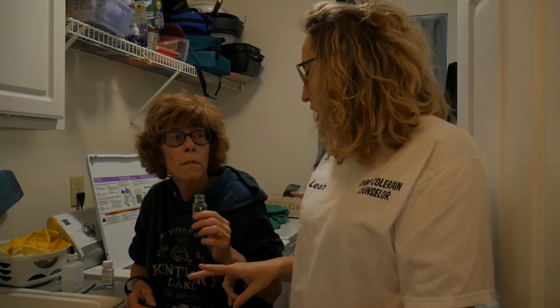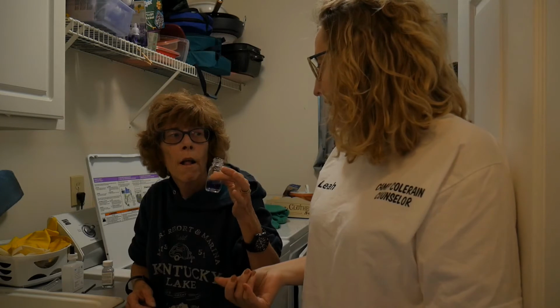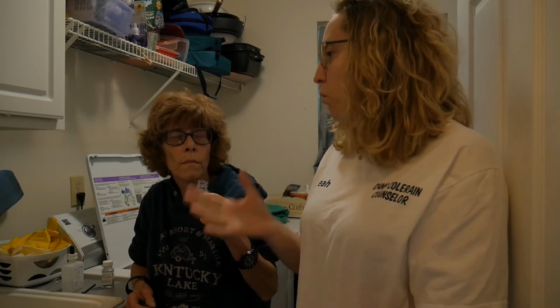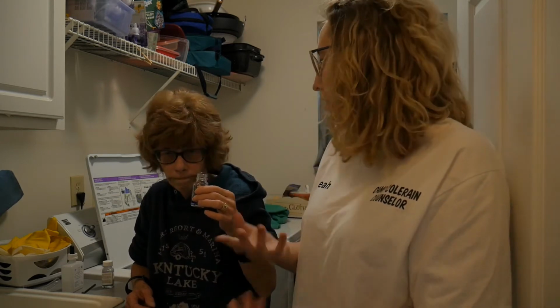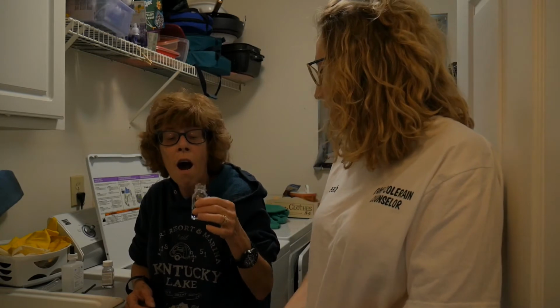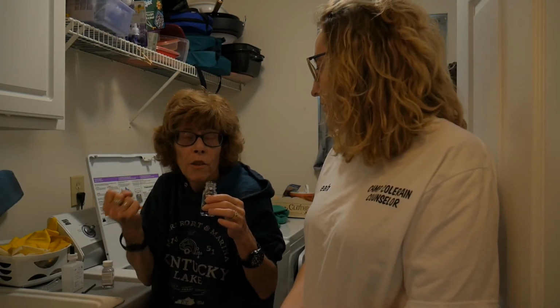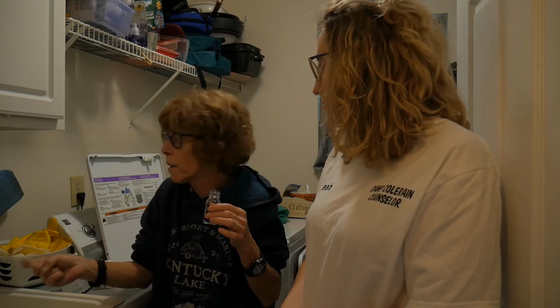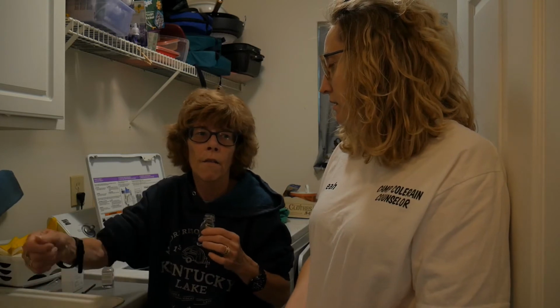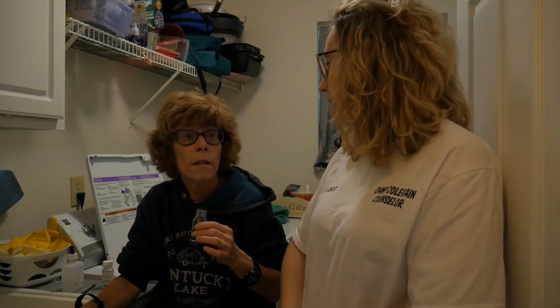So then it took 7 drops to show how hard the water is? How hard the water is. So that's, I guess, a level 7. That's normal. Okay, so then our water is the normal range for hard water. Correct. So then what would it mean if it was a high level? If it was a high level, it would take 12 to 15 drops. That means it's hard water. That's where you get the hardness around your faucets and all that kind of stuff that your moms have to scrape off.